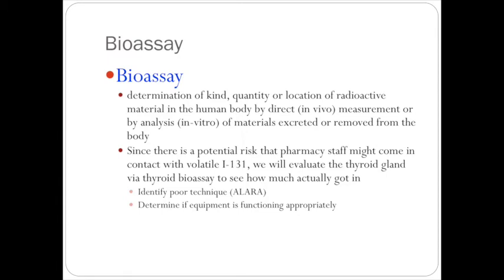So the other nice thing about bioassay, though, is it's a great way of identifying technique. New people tend to have slightly higher bioassays, or are closer to the limits or to having recordable values, than people who've done it for a while. But if you have a huge spill and you're trying to clean it up and you have some issues with that, even the best pharmacist is going to get some level of radiation exposure from the radioactive iodine.